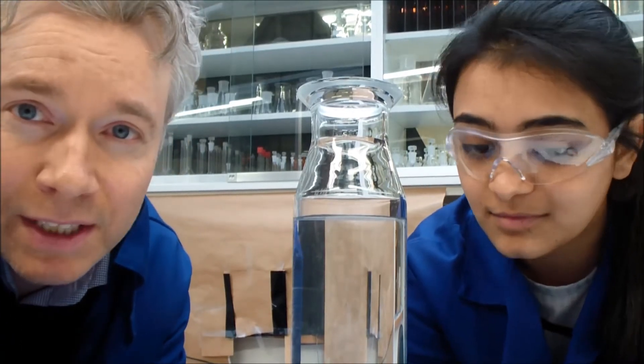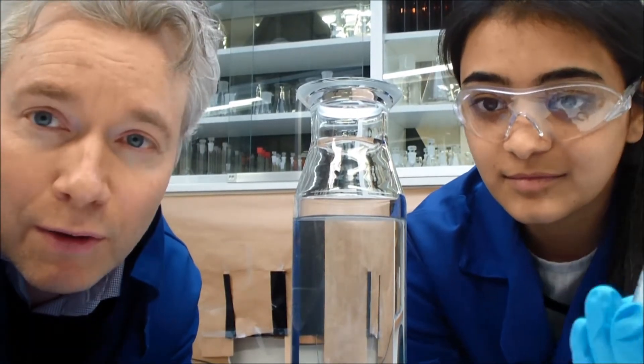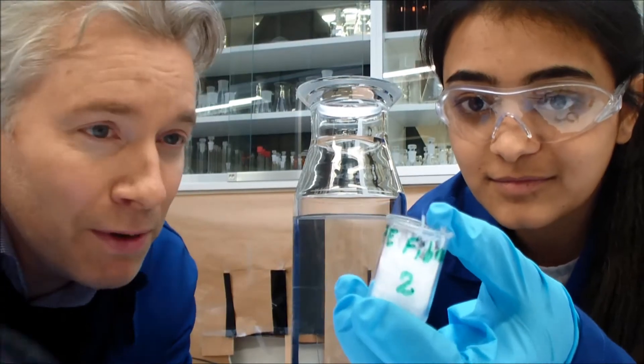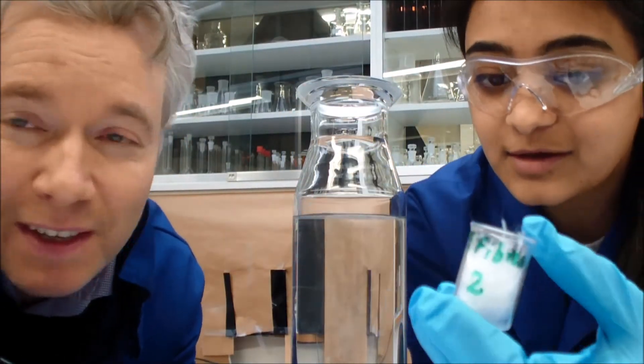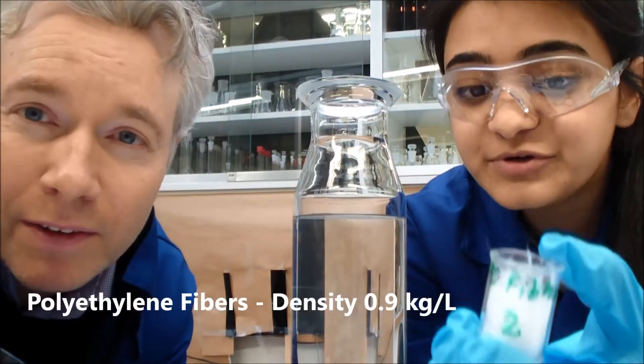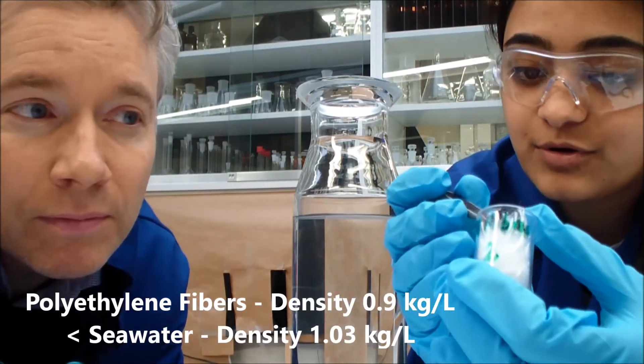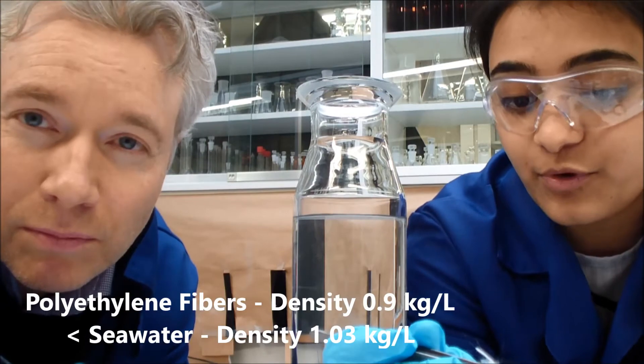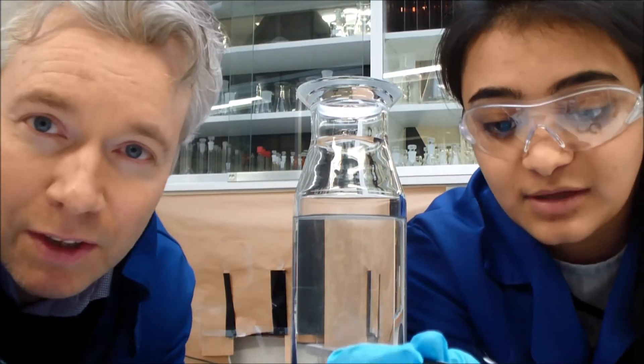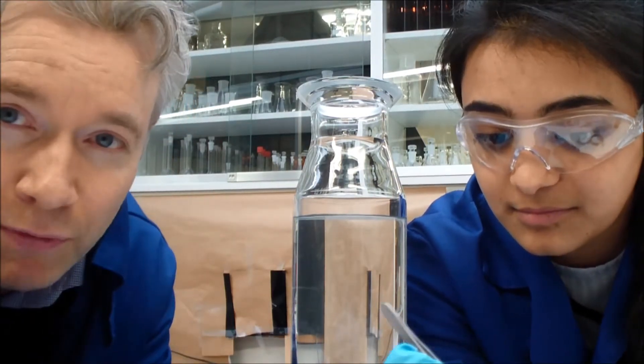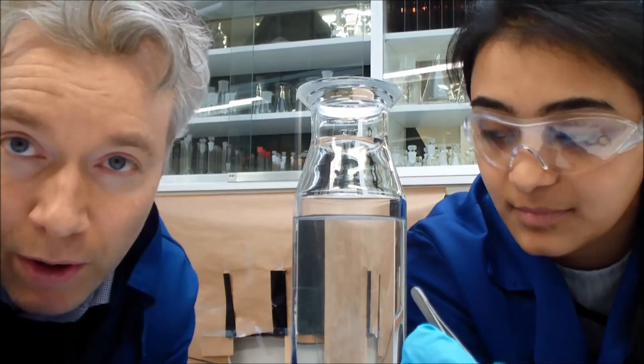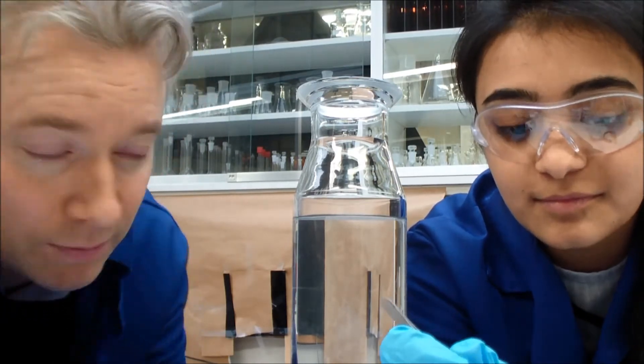Sabna has a sample of polyethylene. Polyethylene fibers have a density of 0.9, and seawater has a density of 1.03. So we expect that once we put the fibers in the water here, they should float. Let's try it.